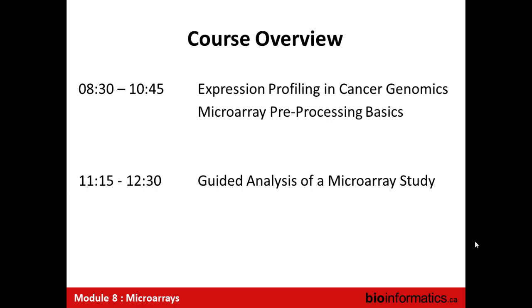And unlike sequencing, you can trivially download a microarray experiment to your computer and work with it. That's one of the nice things about it. And during my PhD, I analyzed most of the major experiments on planes while traveling to conferences. So it's something that becomes much more viable and easier to do while you're on the road.